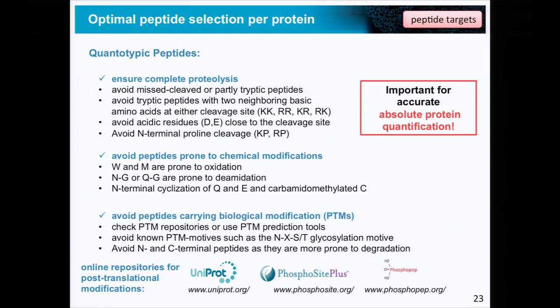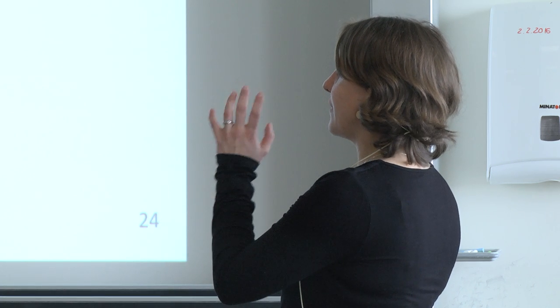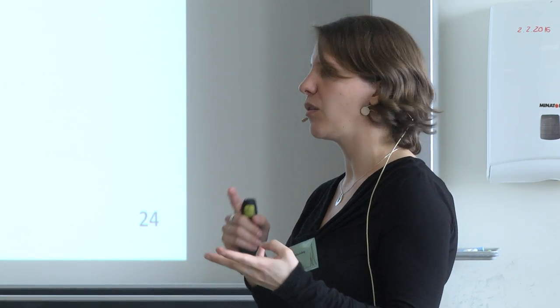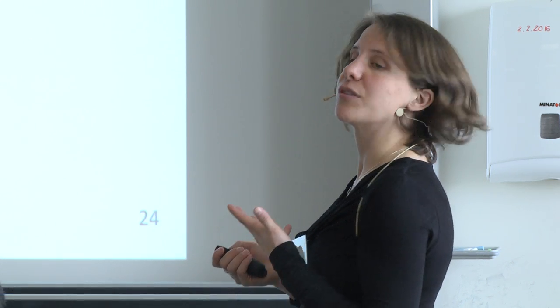Are there any more questions on quantotypic peptides? No? Good. So now we have selected target proteins, and we have selected proteotypic or quantotypic peptides for them. The last thing we need to select are now the transitions.